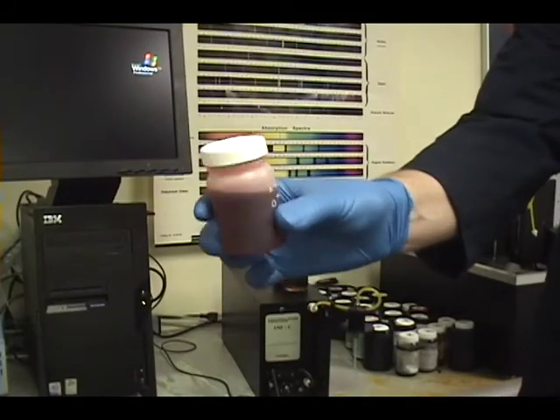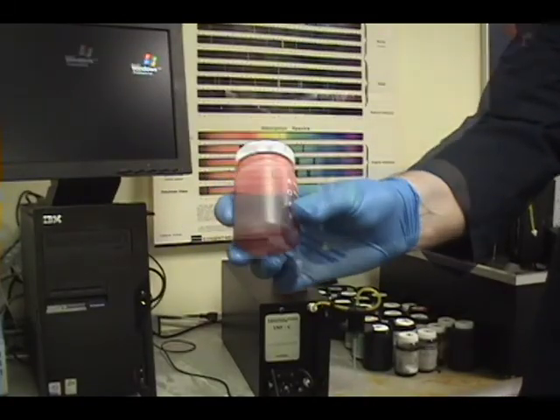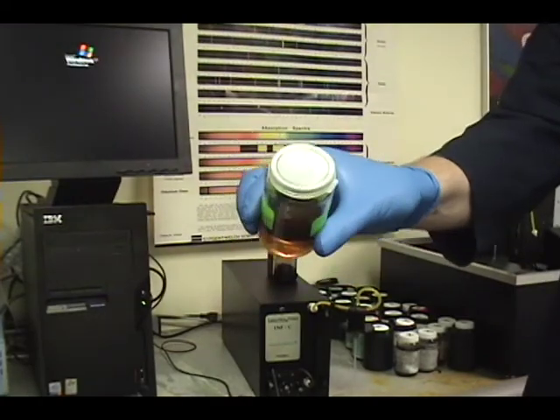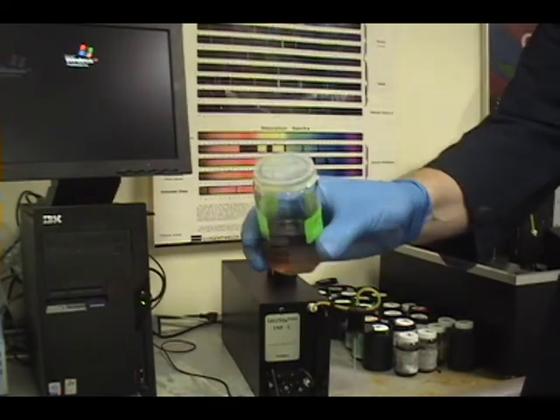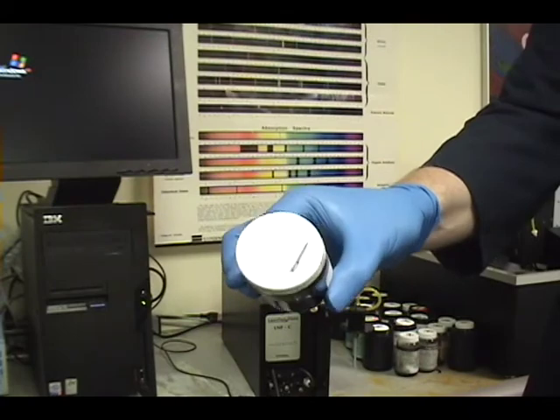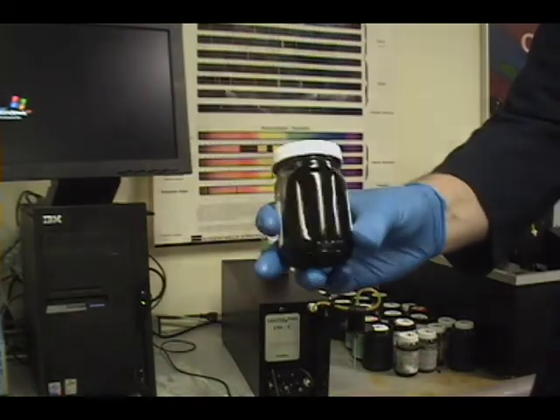The LNF is versatile and can be used to analyze numerous types of fluids. The laser diode in the LNF is powerful enough to process heavily sooted samples, something which other particle counters on the market are not capable of.